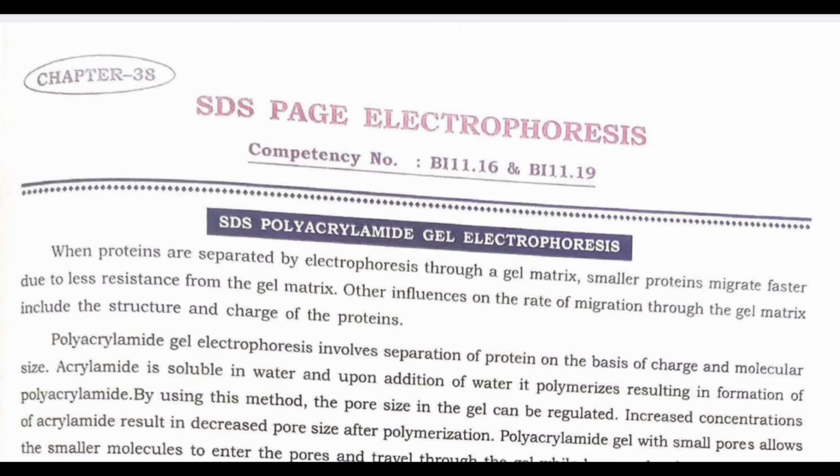Hello friends, welcome to chapter number 38, SDS PAGE electrophoresis. SDS polyacrylamide gel electrophoresis. Let's see what is in this chapter and try to understand something new and interesting.